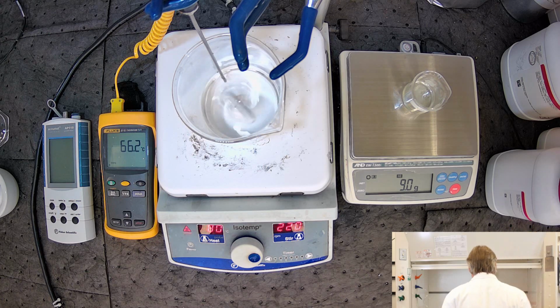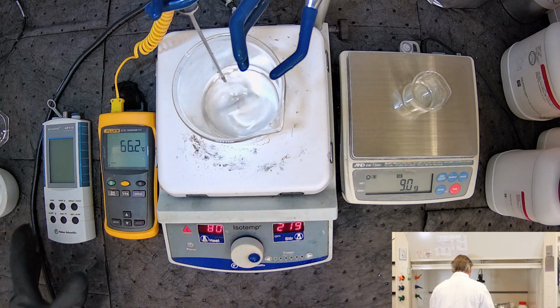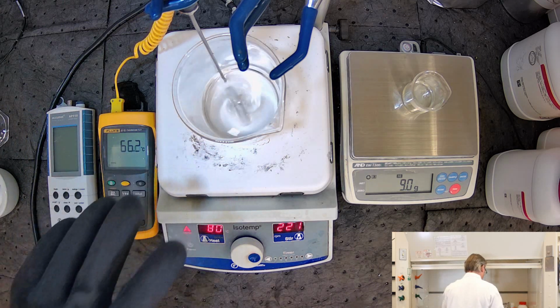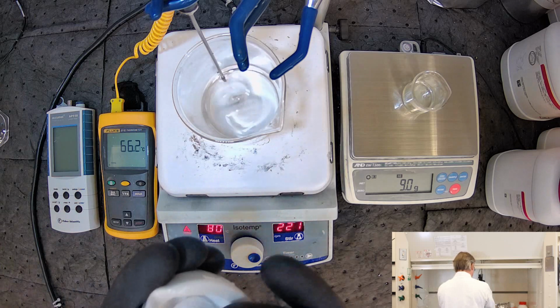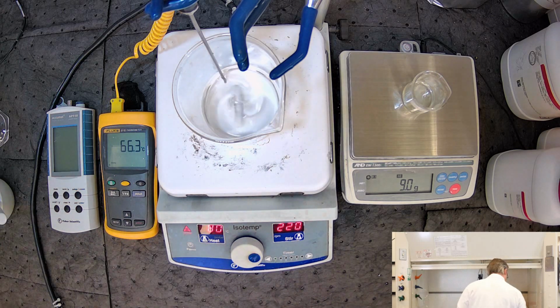Okay, so here we are under the fume hood. So what we have here in our lab is we have a pH meter here. We have a thermocouple to determine the temperature inside the beaker to ensure we're okay. I've made my nicotine over here. I already used my mortar and pestle here to grind up the benzoic acid into a fine powder into this here.